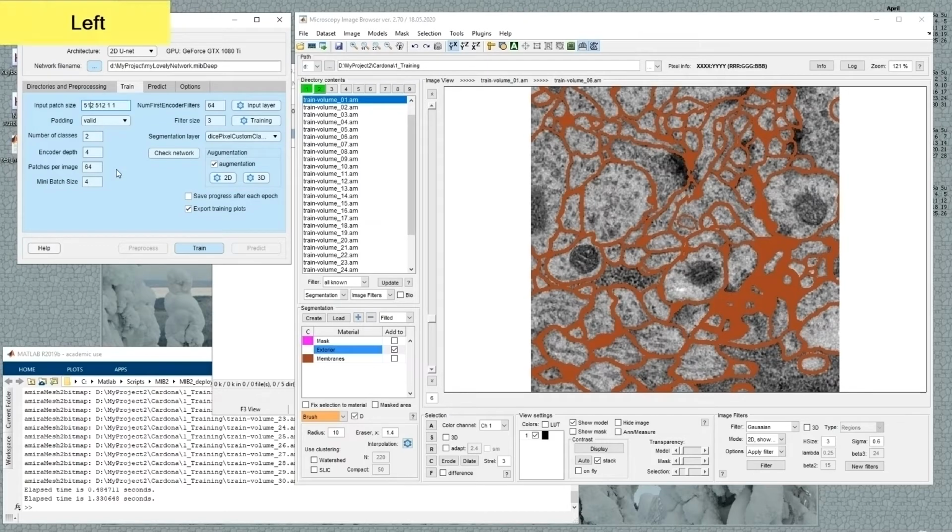So what we're going to do here is just change this to 508 by 508, because it's smaller than the size of our image. It's slightly not optimal, but it's still alright. If we would use the same padding, it actually would work right away.